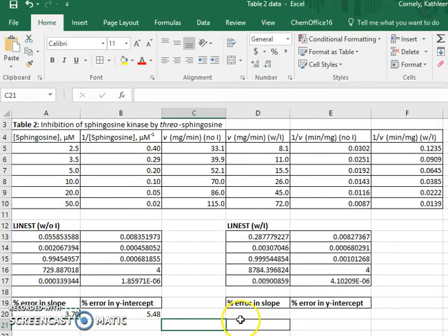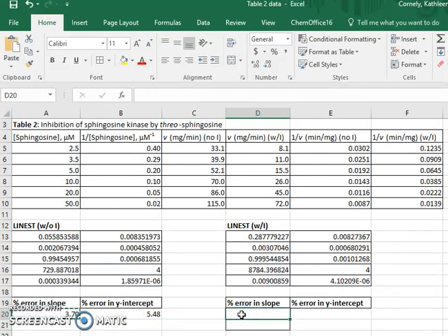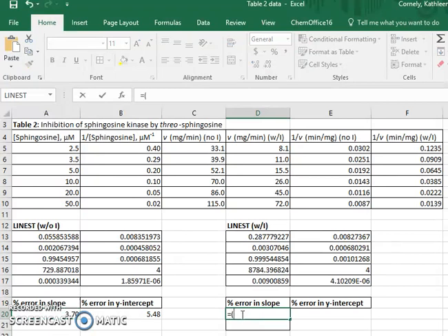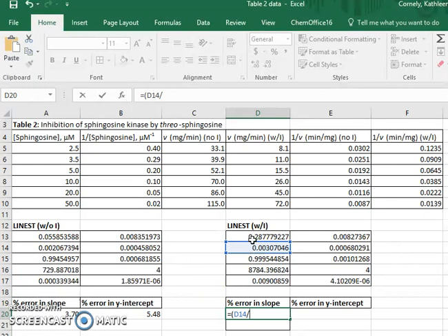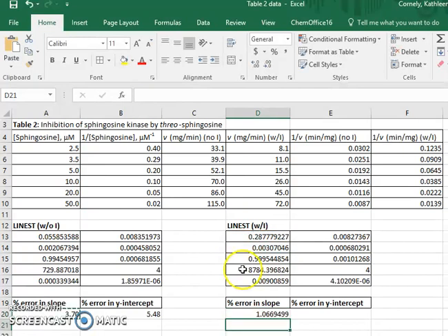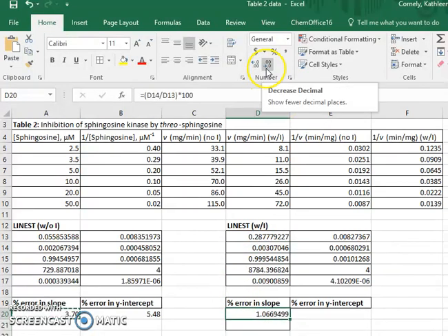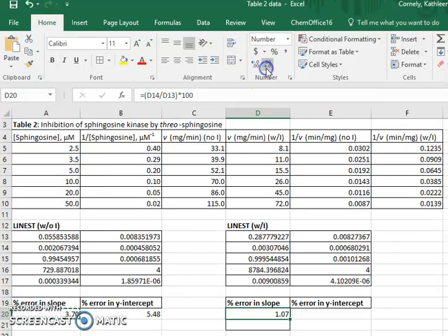I will also do this with the line-est data with the inhibitor. So again, the error in the slope divided by the slope itself multiplied by 100 and decrease the number of significant figures to 3.